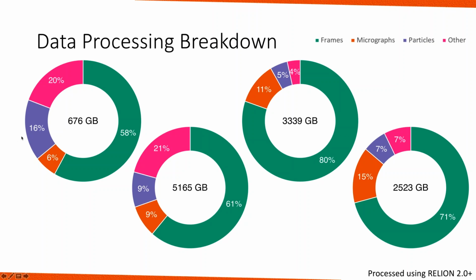So this user here, most of the data here of the 600 gigabytes is frames, raw frames. Those you can't really account for how big they are. They're as big as they are. They extracted micrographs, they extracted particles. This is a very particle dense, or very densely populated images.